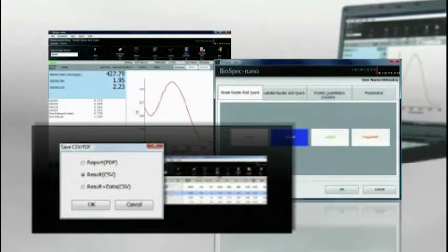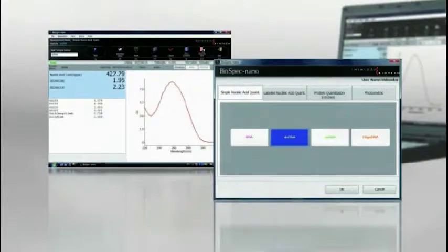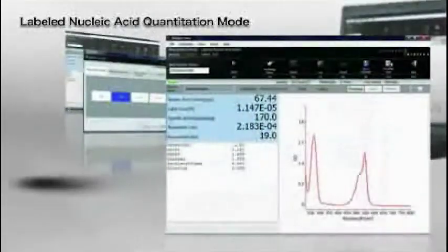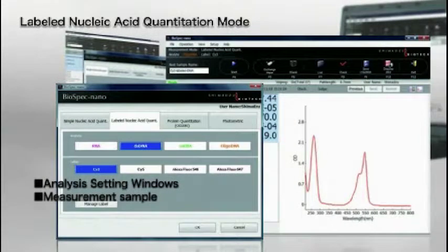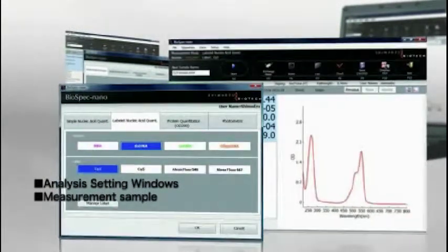The nucleic acid concentration and optical density ratio are calculated. For the quantitation of nucleic acids labeled by cyanine-3, etc., the nucleic acid concentrations, label concentration, nucleotide concentration, and labeling ratio are all calculated.